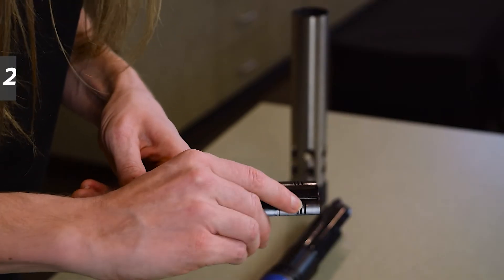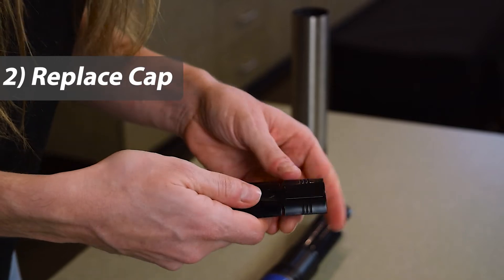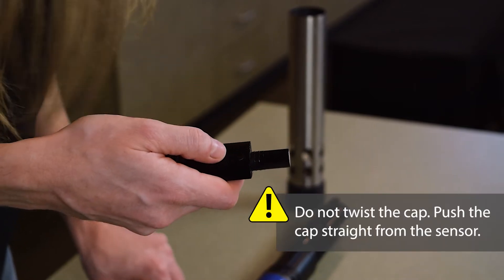Now you can see there's a little tab. You'll want to pull that up with your thumb and then push the old cap off of the sensor.